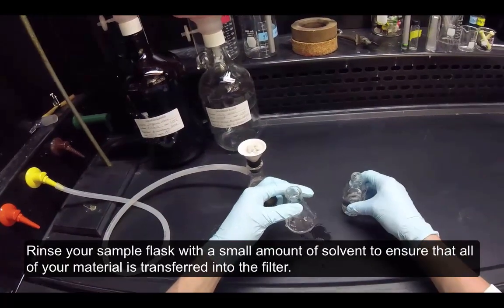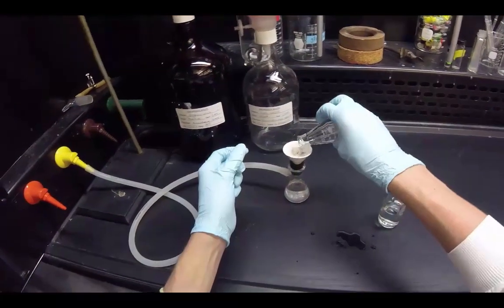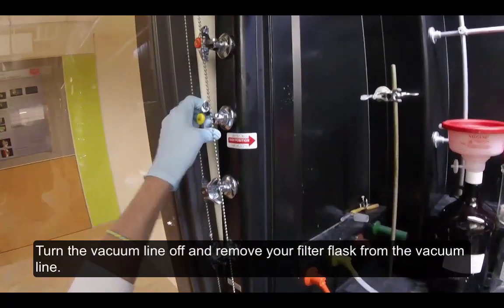Rinse your sample flask with a small amount of solvent to ensure that all of your material is transferred into the filter. Turn the vacuum line off and remove your filter flask from the vacuum line.